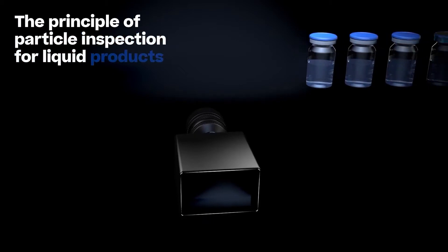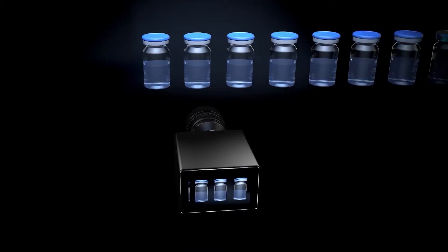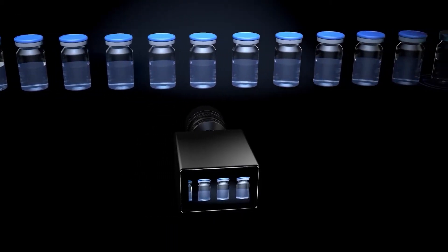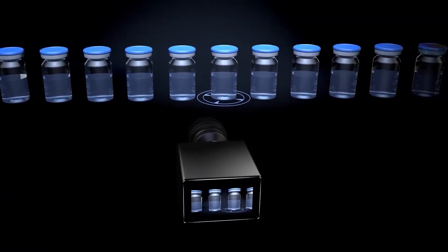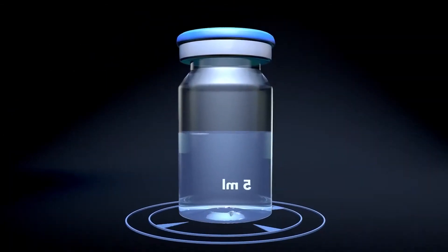The principle of particle inspection for liquid products: Conventional camera inspection by Seidenader Solutions identifies particles in liquids by monitoring their changes in position. Stationary markings, scratches or contamination on the outside of the container can therefore be clearly differentiated from particles inside the container.